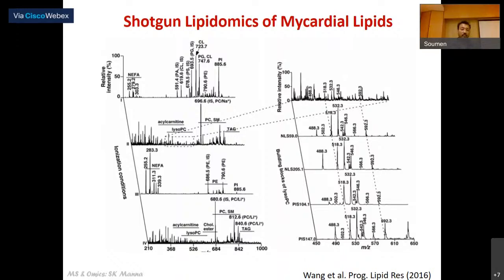So typically, it is recommended that if you have a Gaussian peak, you will have at least 12 data points on the peak, if you want to get a good peak shape. So your cycle time, therefore, has to be the peak width that you get divided by 12, or less than that.